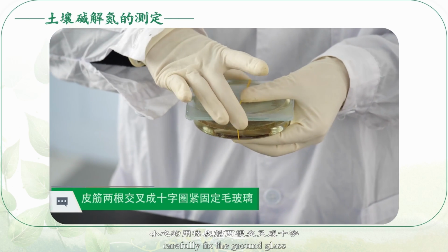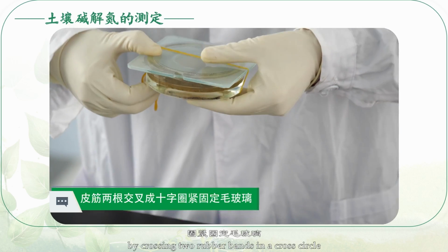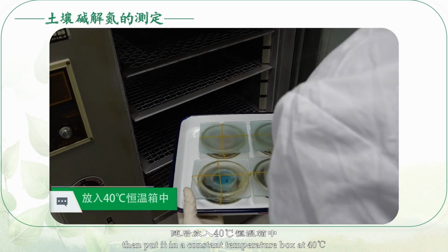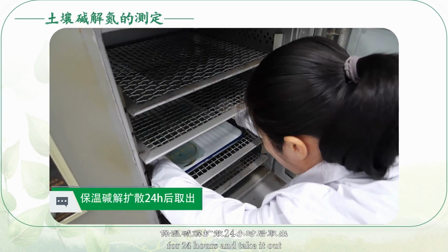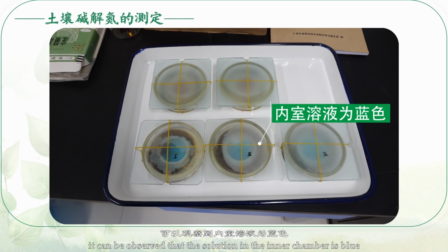Constant temperature diffusion. Gently rotate the diffusion dish horizontally to fully mix the solution with the soil. Carefully fix the ground glass by crossing 2 rubber bands in a cross circle. Then put it in a constant temperature box at 40 degrees Celsius for 24 hours and take it out. It can be observed that the solution in the inner chamber is blue.